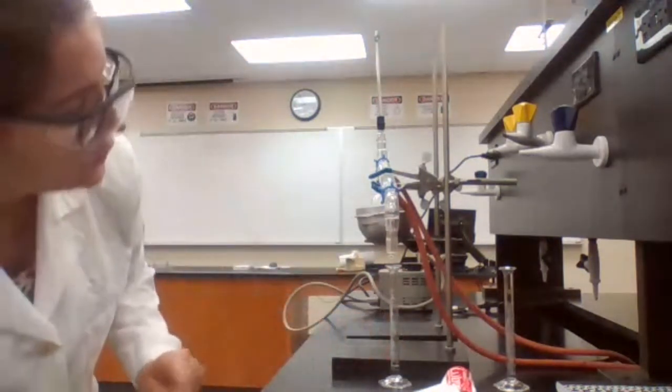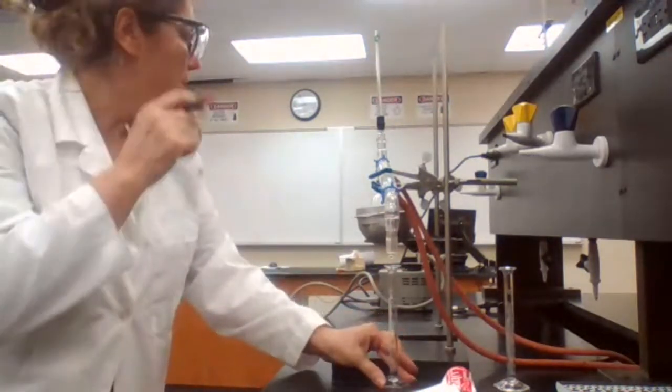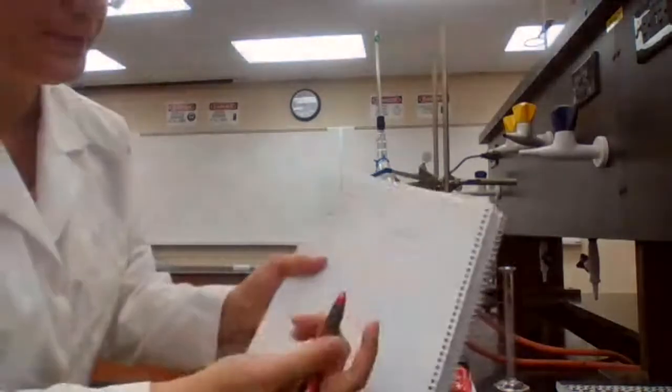Okay, we are still waiting for the 2 milliliter collection.